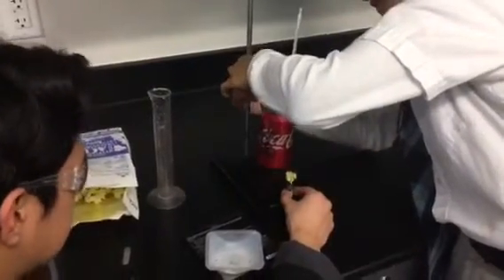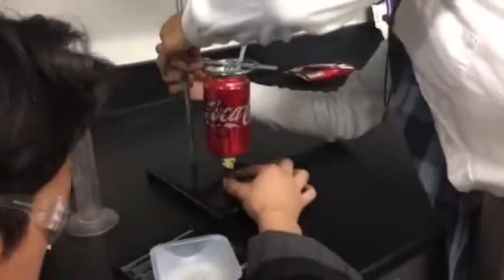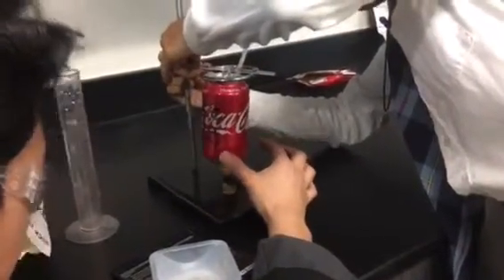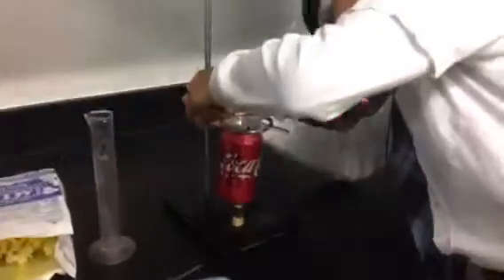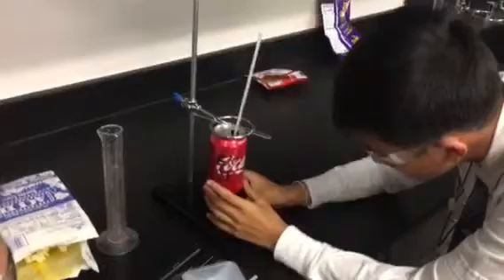This Cheeto weighs 0.8 grams. We have to raise it because it's too high. I would say just there. Okay, now you have to light the food sample.